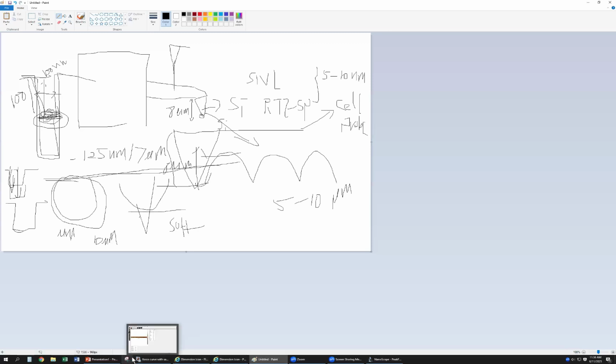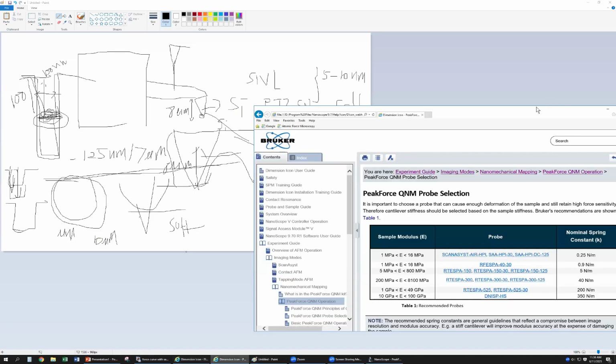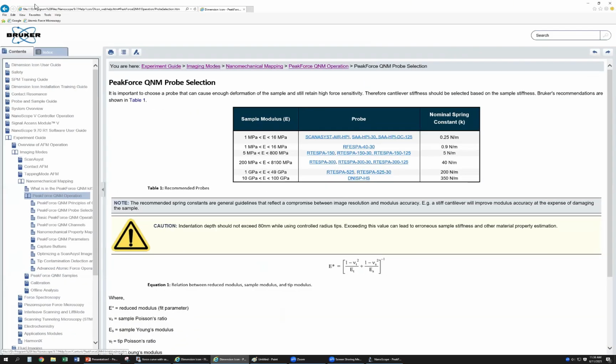If you forgot about this, you just go to the website. Where is the website? Here. So go to your machine and open the help. All these menus are listed.